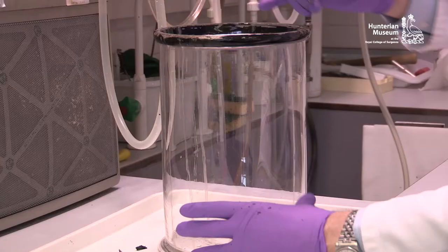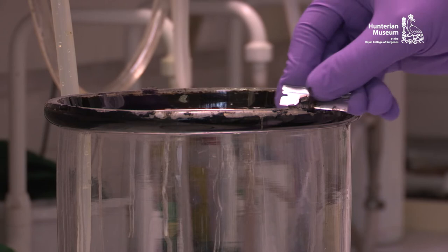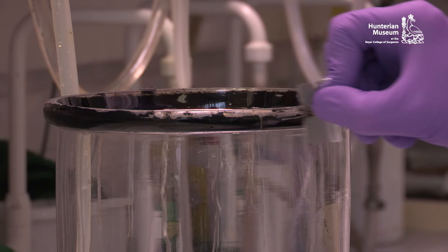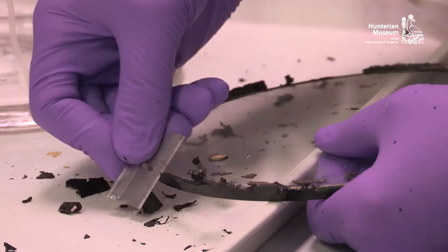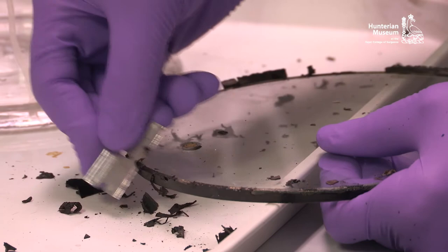It is essential to remove all previous sealant, dirt and grease from the rim of the jar and the glass lid to ensure a good seal when the specimen is remounted. A safety razor blade is an ideal tool to scrape away excess pitch. For stubborn areas, the application of a little white spirit will dissolve the pitch. De-greasing and cleaning can be carried out using water and detergent.